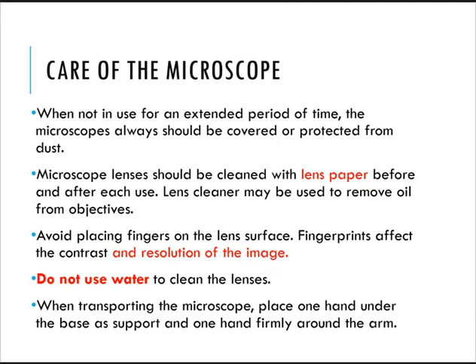Okay, so you may say, very important pala ang fingerprint, because it can make you doubt what your specimen actually looks like. Now we have here, as I've told you, do not use water to clean the lenses. We have a designated lens cleaner for that.